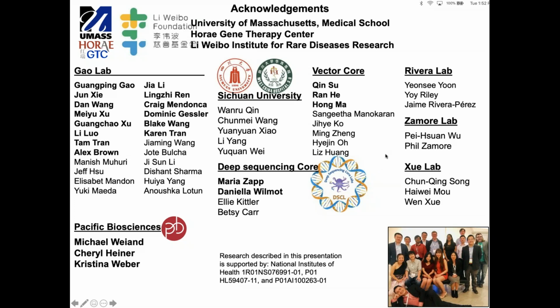So one is for the AAV GP-seq, what was the percentage of full-length genomes versus truncated genomes? Right, so this is a very good question. We do see a lot of variability prep to prep, even with the same vector design. It all depends on what you've designed into your AAV. If it has very few secondary structures designed into the vector, the percentage of these truncation events is very minimal, I would say less than 10 to 20%.